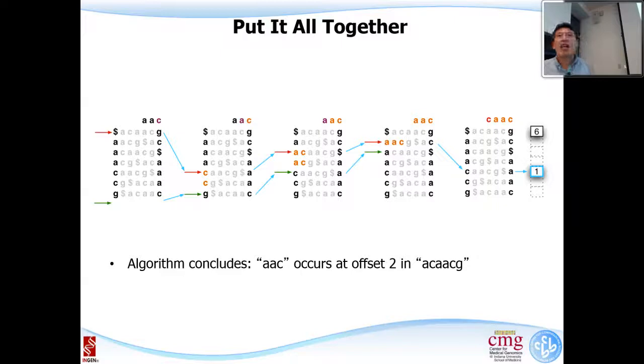And the second advantage is that if you think of the query speed, this is linear to the query size, so how long your sequence is. In this case, I have 3 letters. I will just walk through 3 steps, give or take, and I will be able to identify where I am.